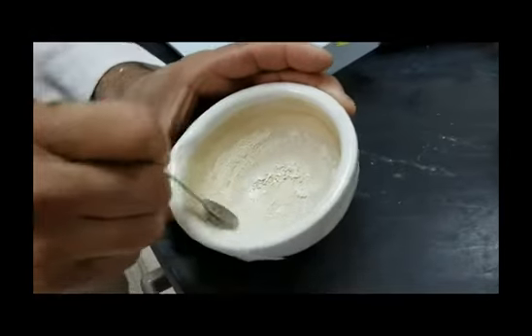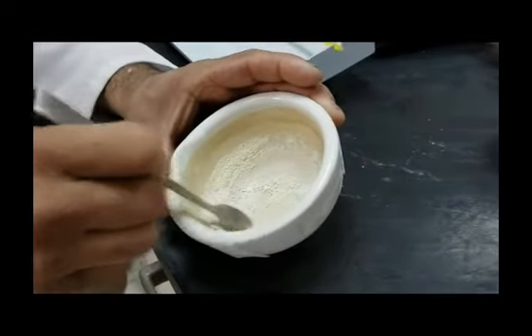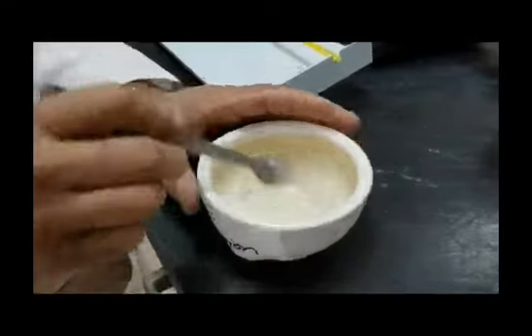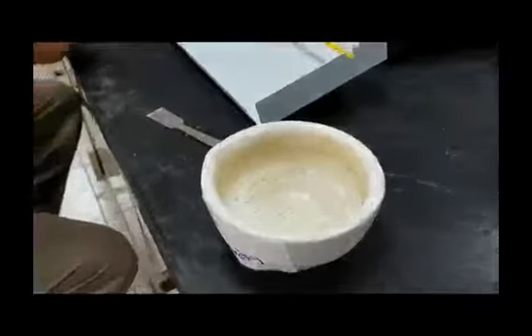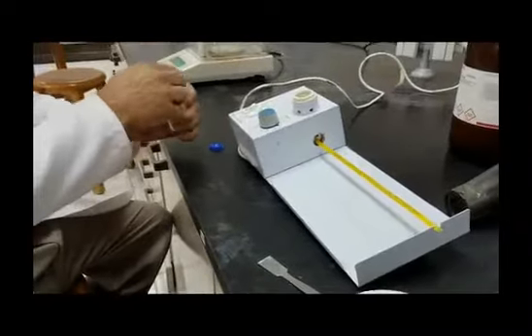To measure the melting point, we should start with filling the capillary tube with our salt and a second capillary tube with mefenamic acid.